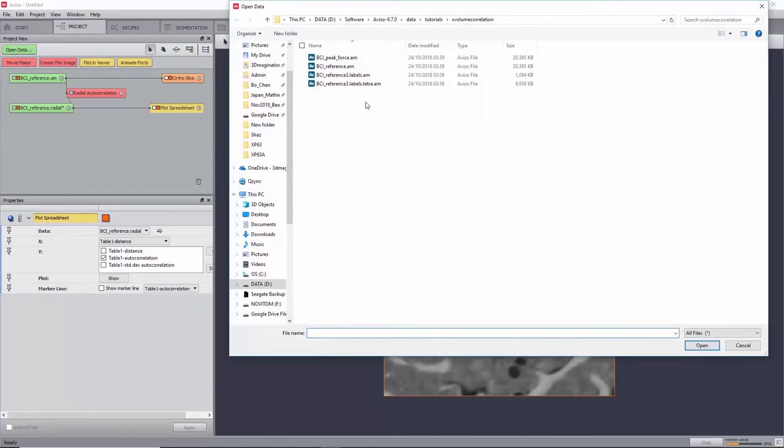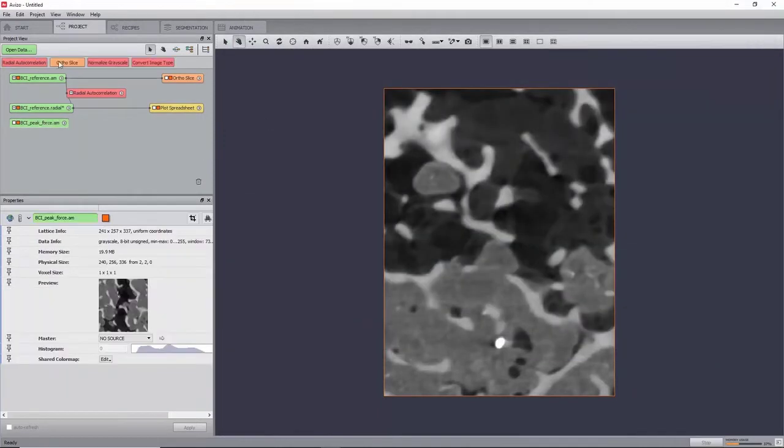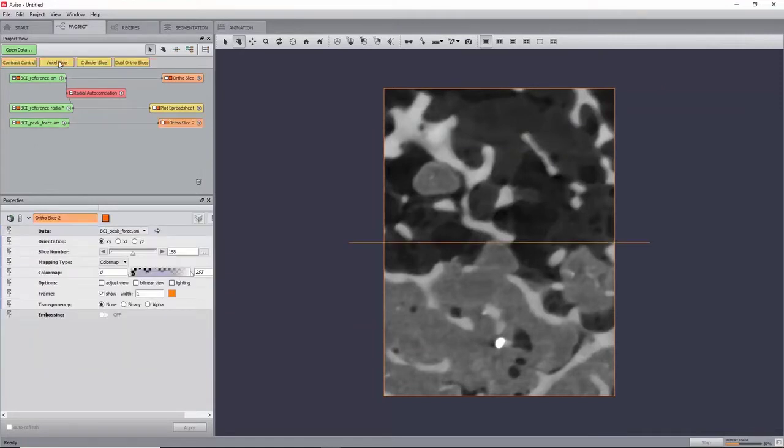Now, load the second image of the time series, bci.peakforce.am, to which we will refer as deformed.